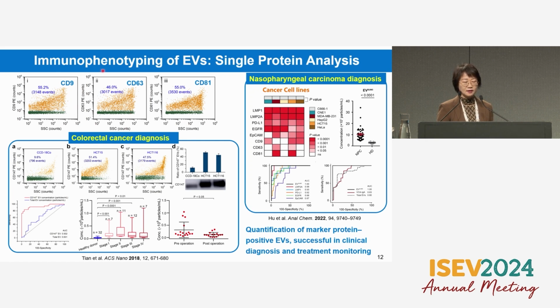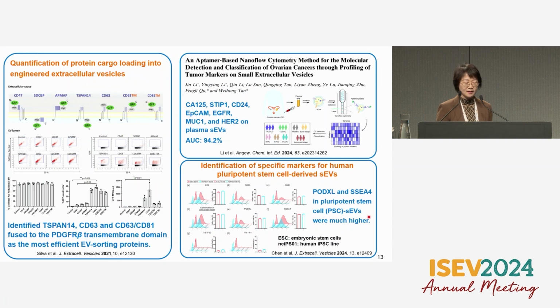And these strategies have been used successfully in clinical diagnosis and prognosis. And so the commercialized nanoflow cytometers have been adopted extensively by researchers globally.